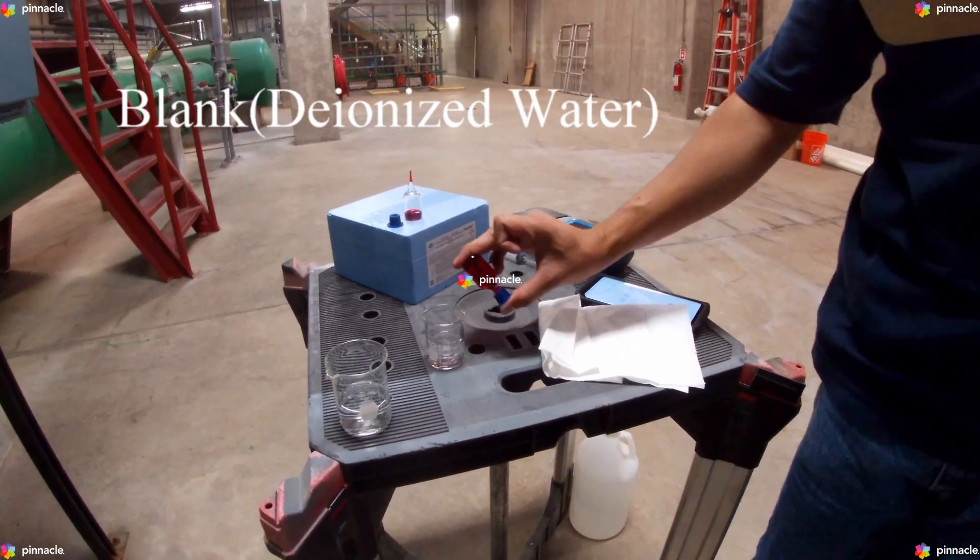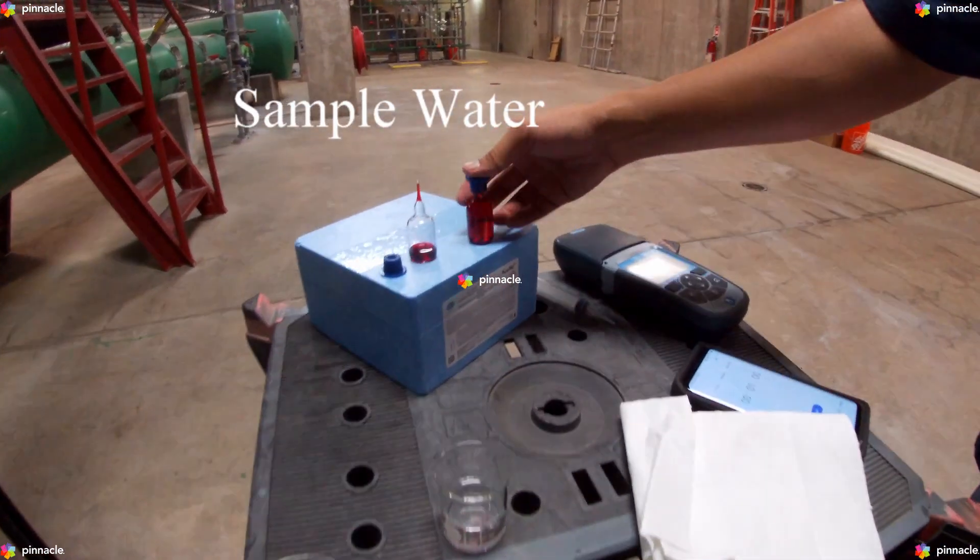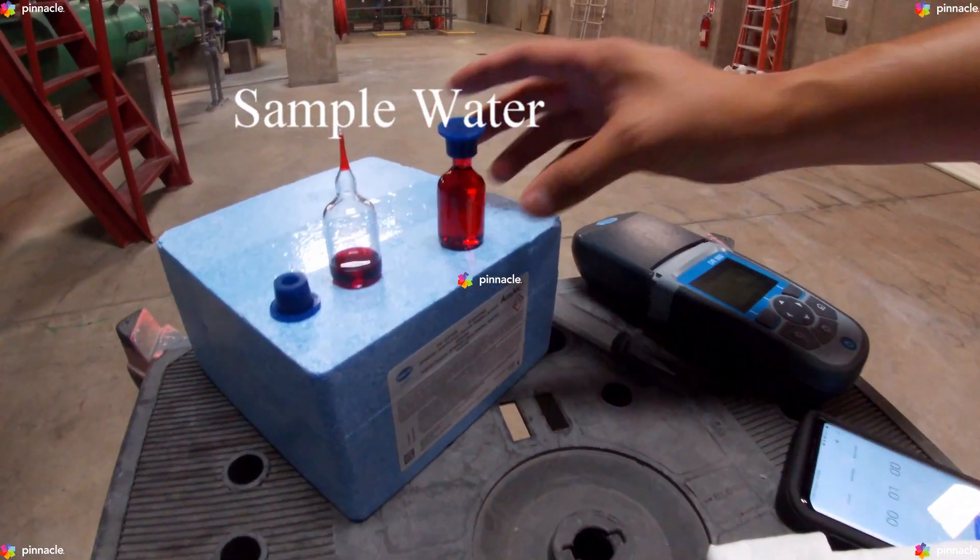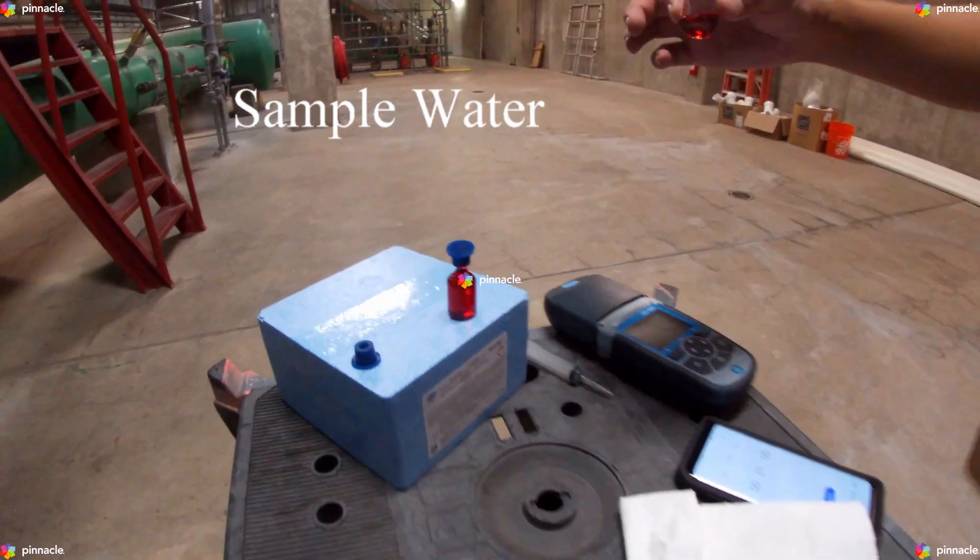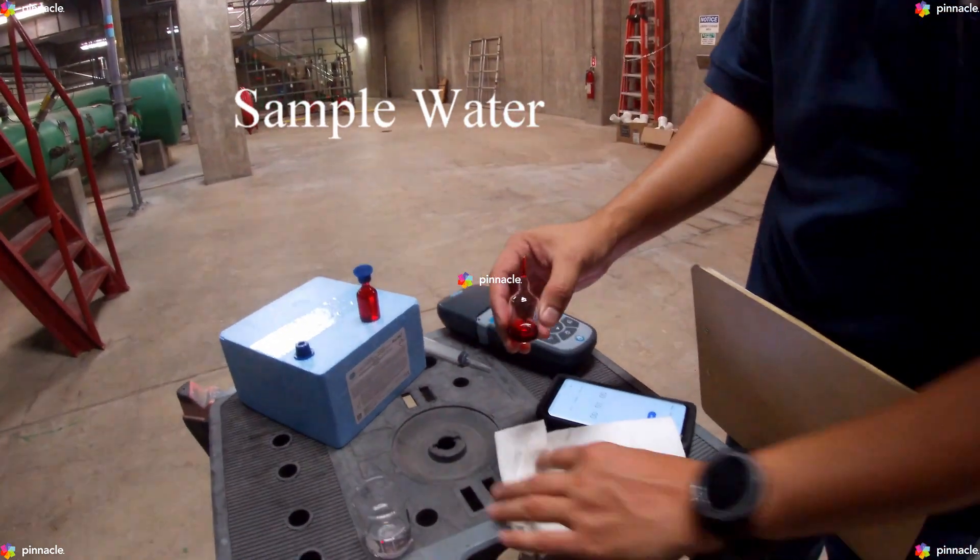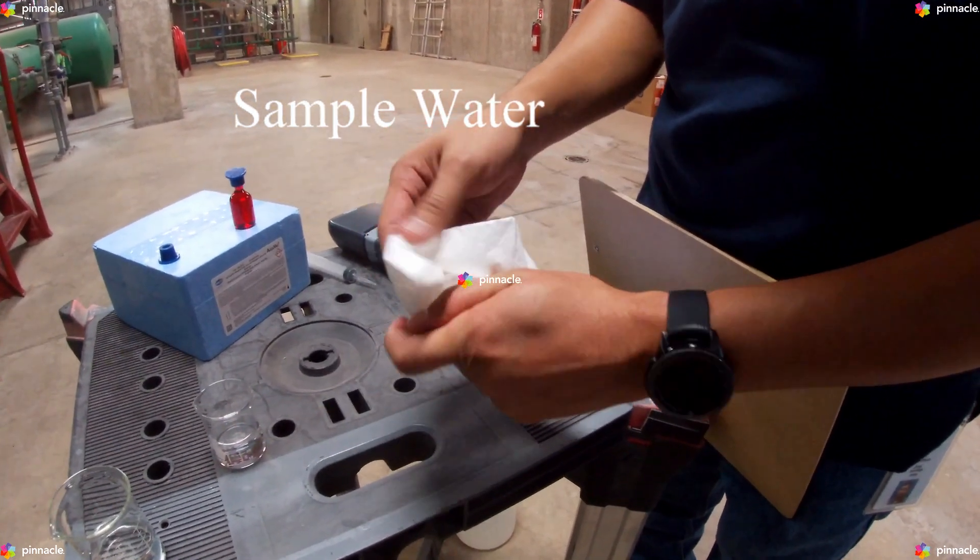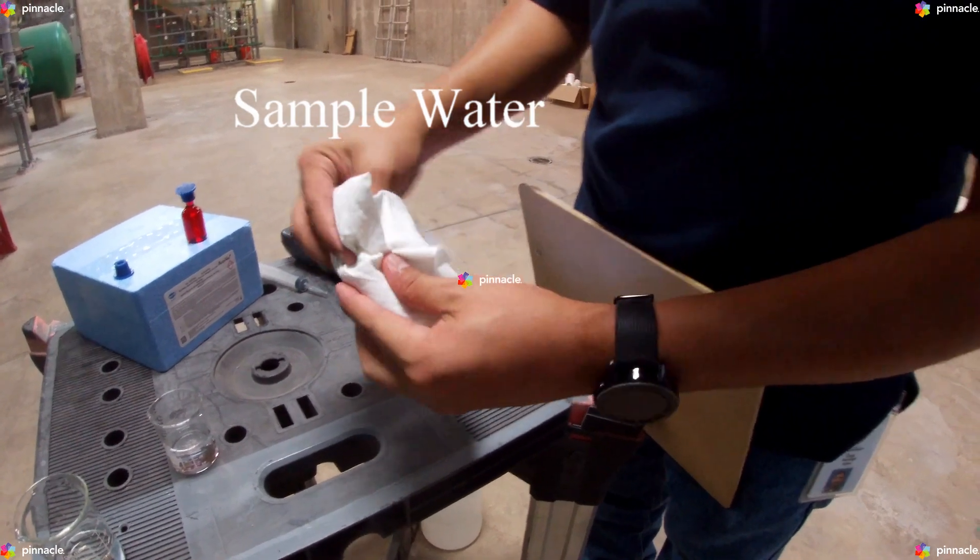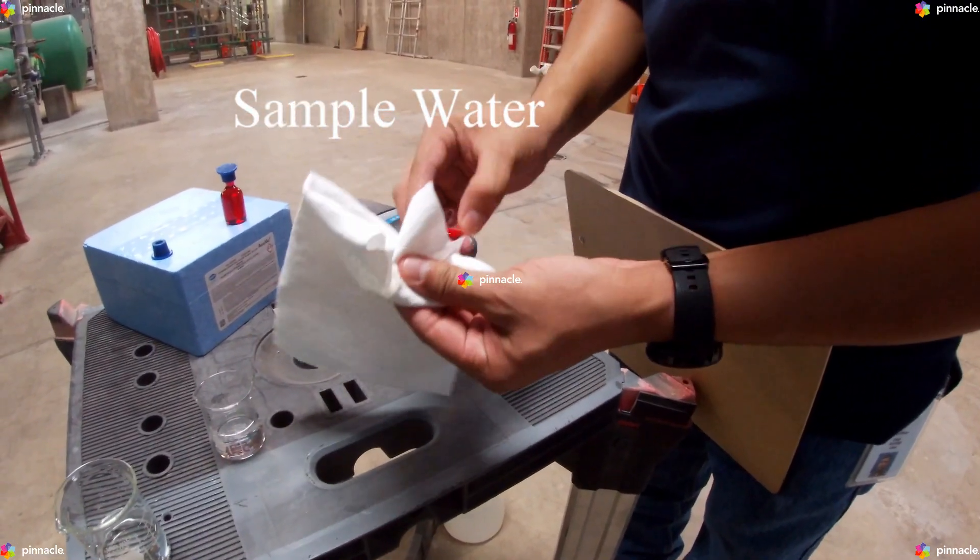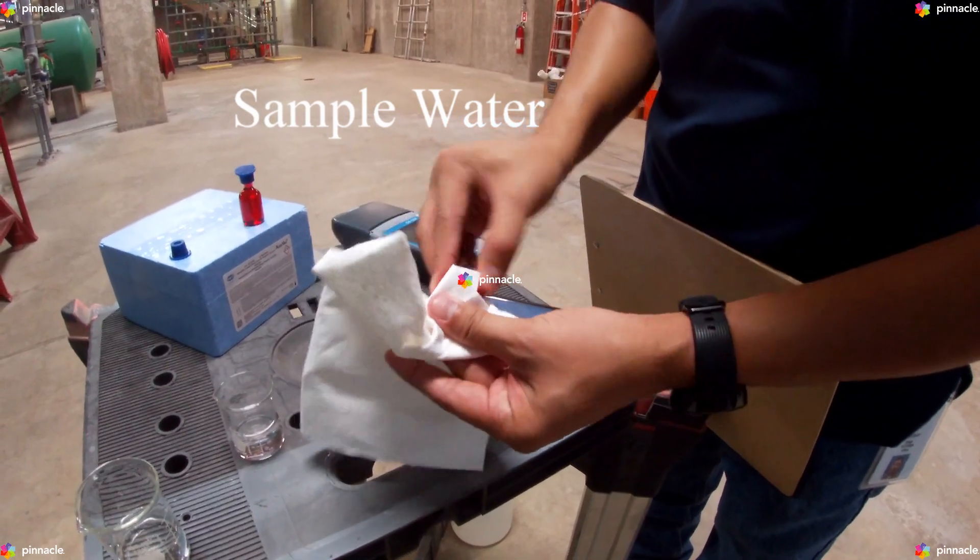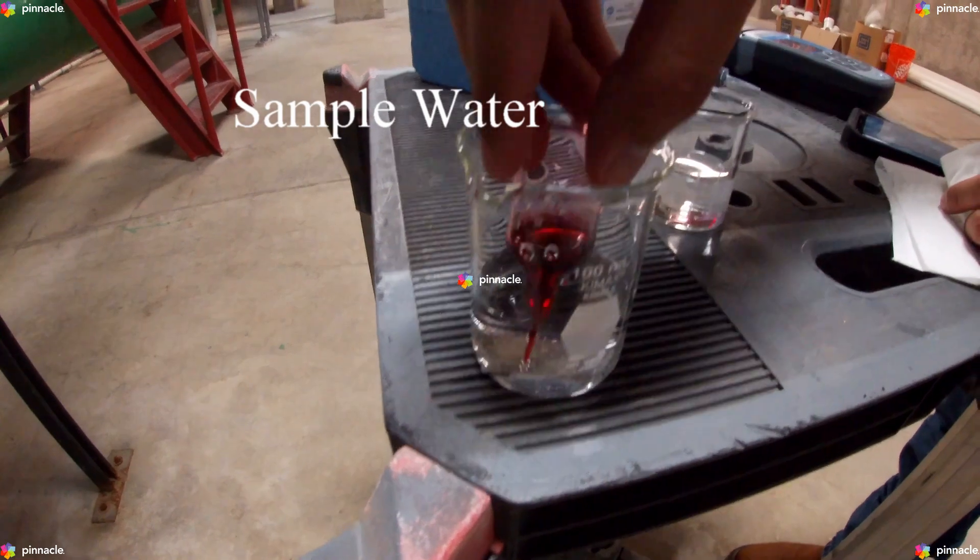Next, we will grab our second AccuVac Ampoule and make sure to clean the tip thoroughly before submerging into our sample beaker. We will keep the tip immersed while the AccuVac Ampoule fills completely.